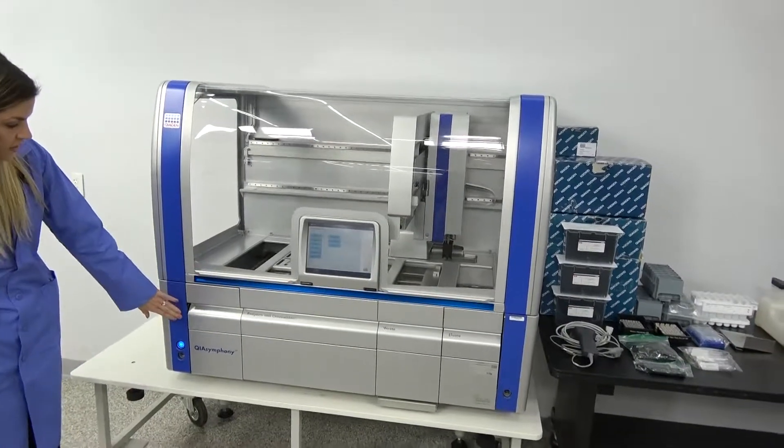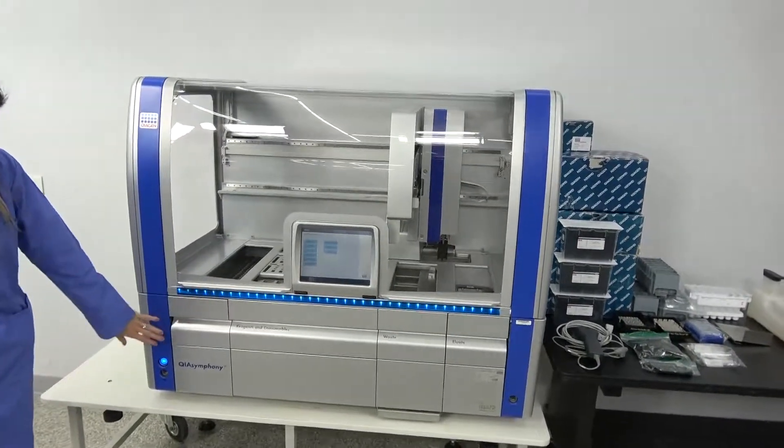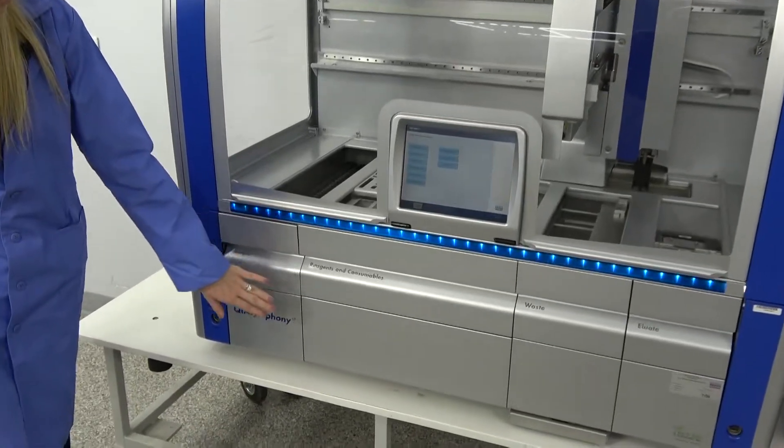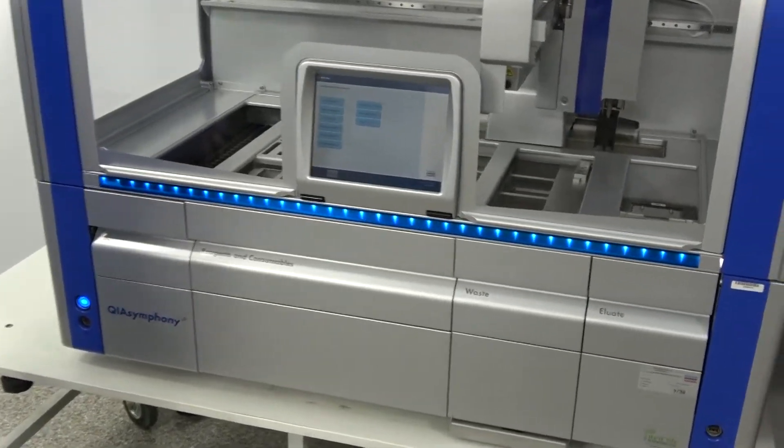Down here you'll see all of the drawers that are available. We have the sample drawer, the reagents and consumables. We also have the waste and the eluate.